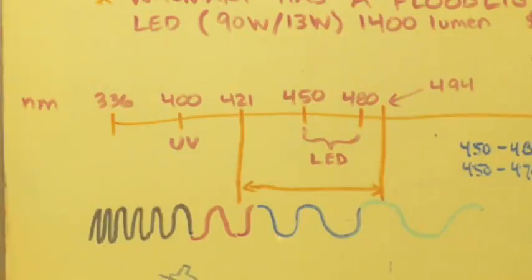Now, remember, if you watched my video on benzyl chloride via free radical halogenation, you'll know that I talked about intensity. I said if you only have 1 photon per hour coming out of your bulb or your light source, that's going to take you forever. You'll be breaking one bond a second. It'll take forever and ever. So intensity plays a part. You need it to be strong enough. Being blue light makes it strong enough to break the bonds.